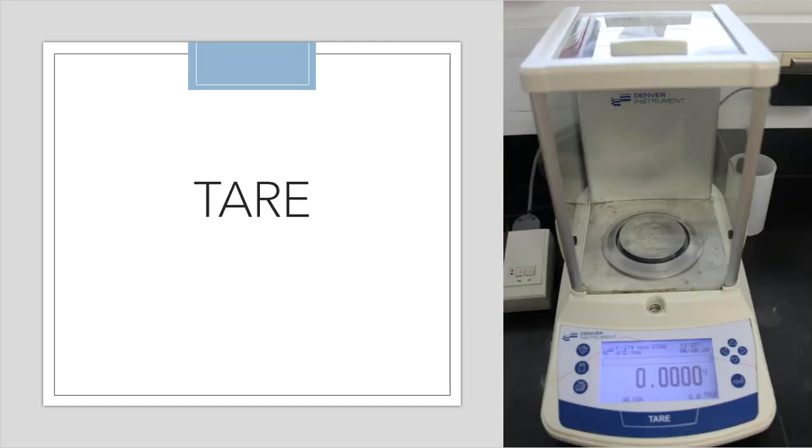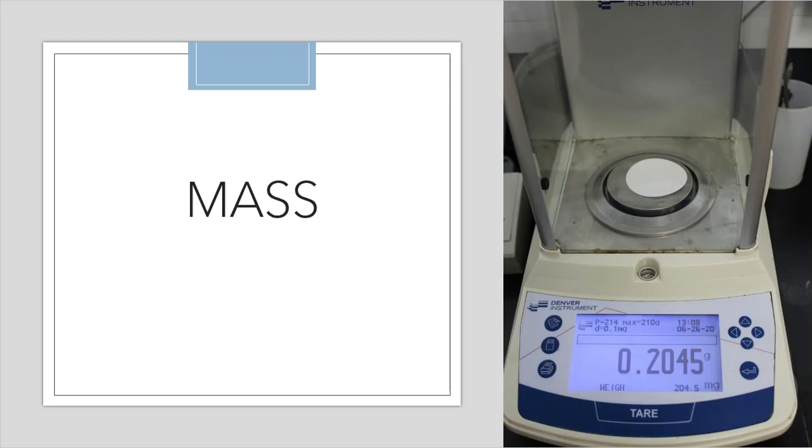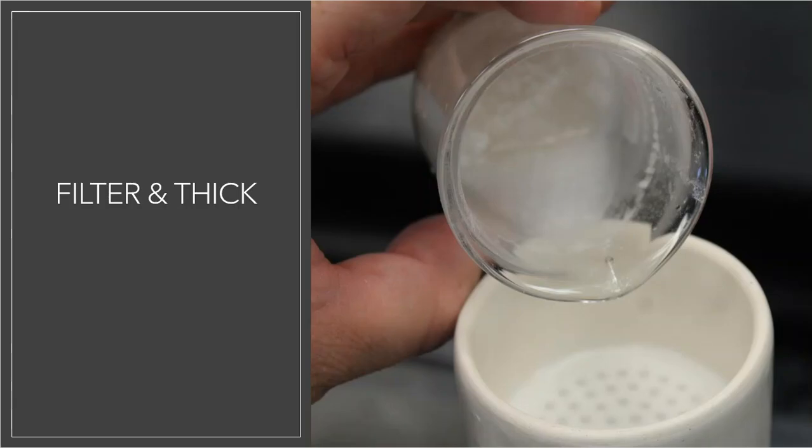I go back to the balance. I tare it out. I go back to my filter paper and get another sheet of filter paper, same make, manufacturer, and style. And then I get a mass of that filter paper, 0.2045. So that filter paper goes back into the Buchner funnel, and I take that recrystallized product and pour it through. Again, make your observations.